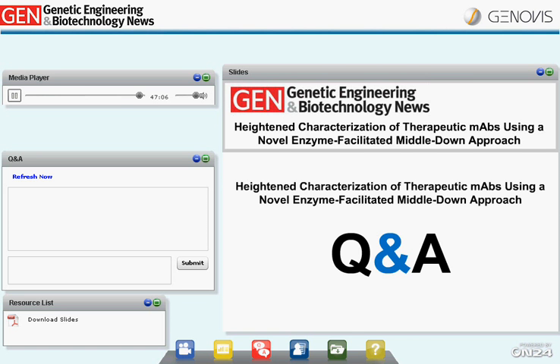Okay, another question for you, Frederick. Typically, what is the enzyme-protein ratio used? Usually the enzyme to protein ratio is 1 to 50.